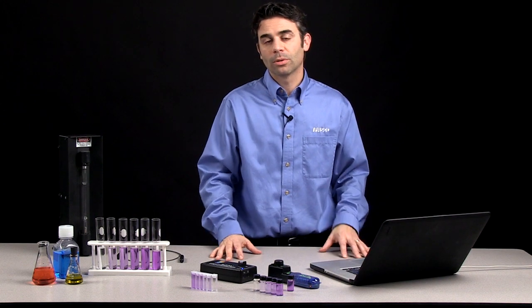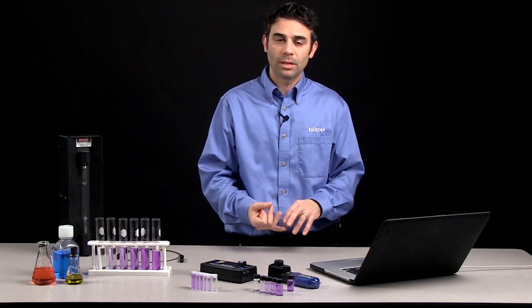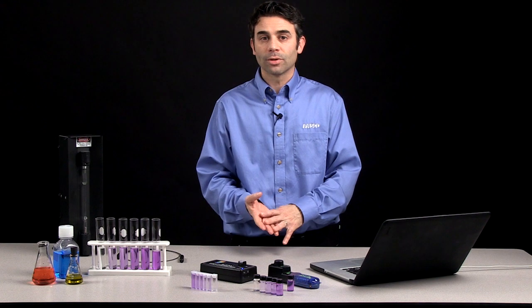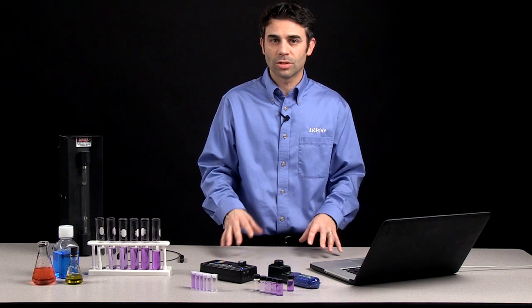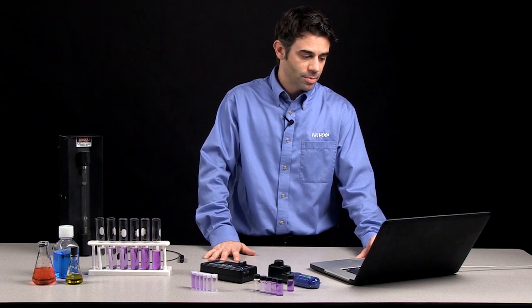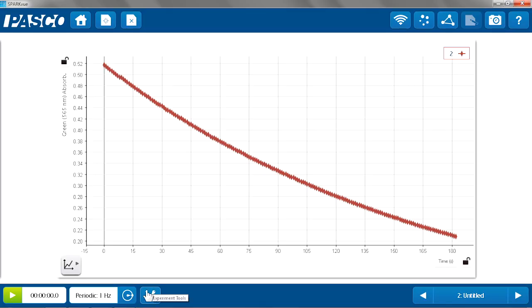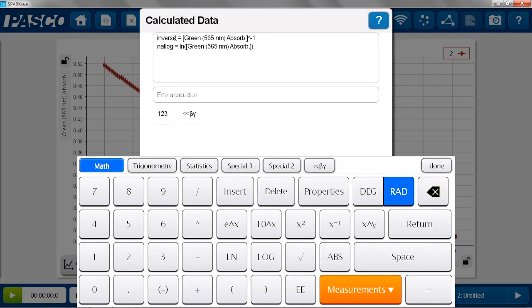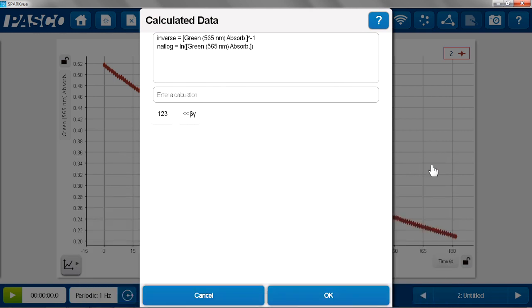To do the kinetic studies, you really want to be able to look at not only the absorbance, but the natural log and the inverse of the absorbance to see which one of those is a straight line to determine the order of the reaction. Both SparkView and Capstone allow us to make calculations. So in this case, I created some calculations, inverse and natural log.